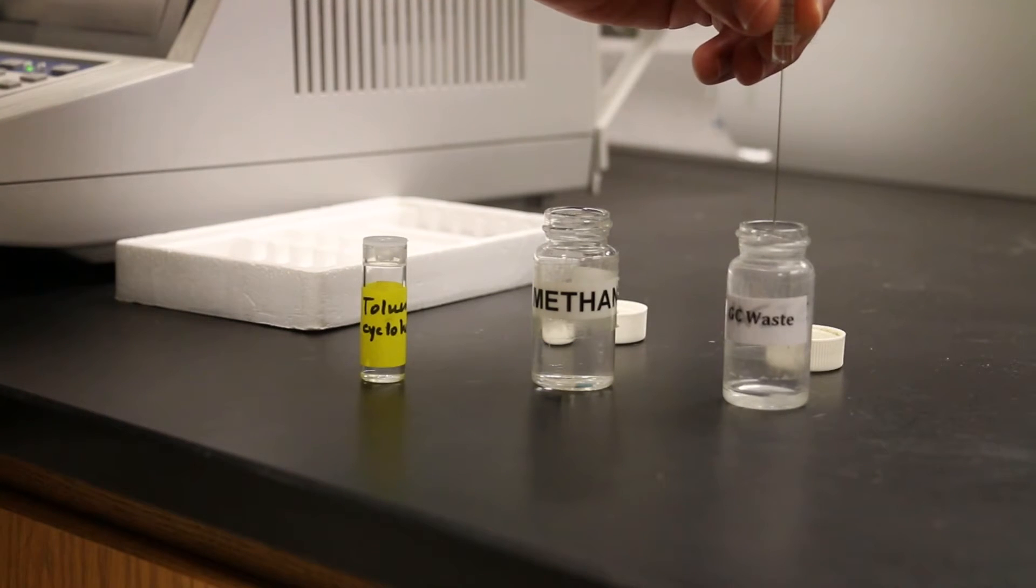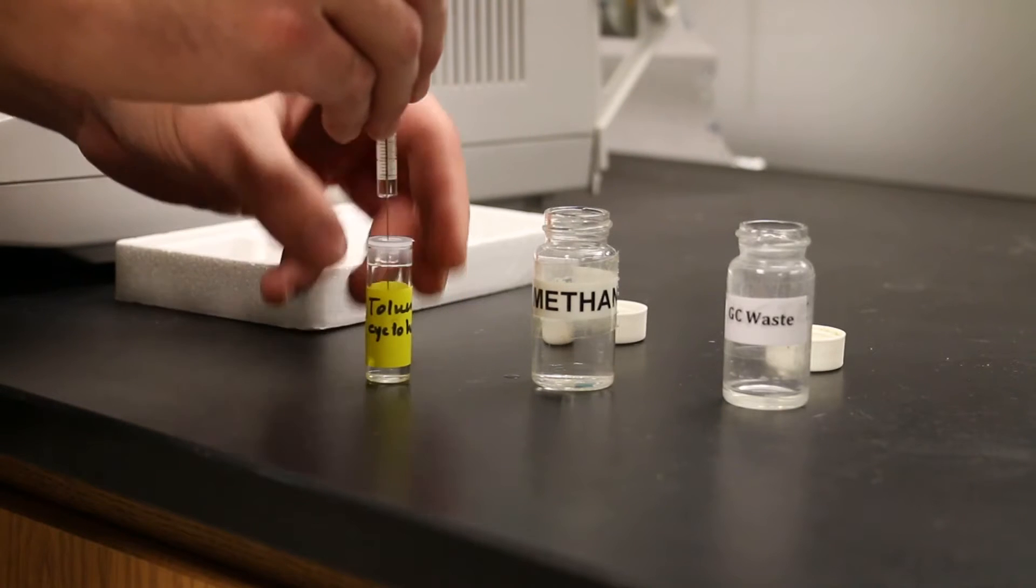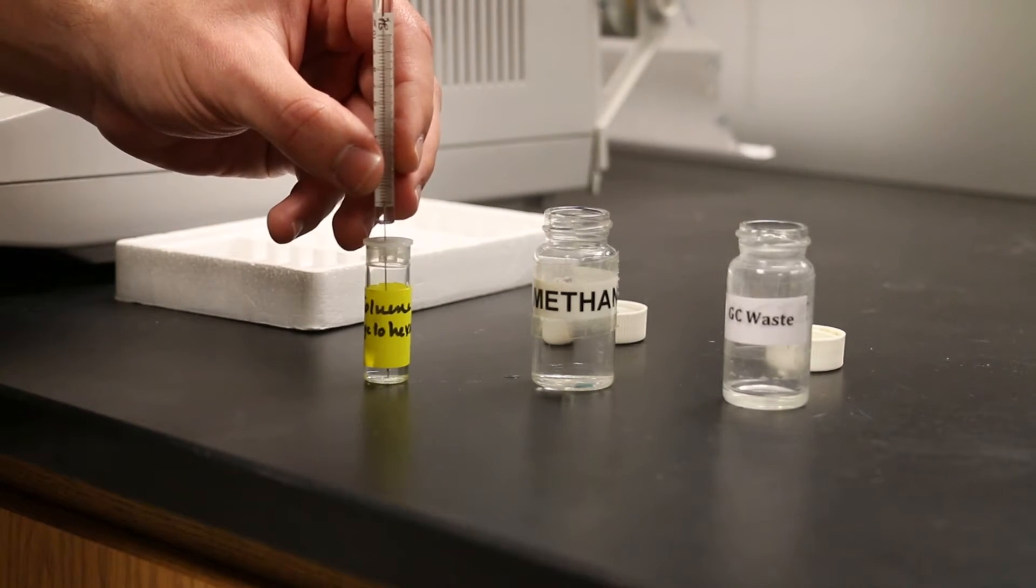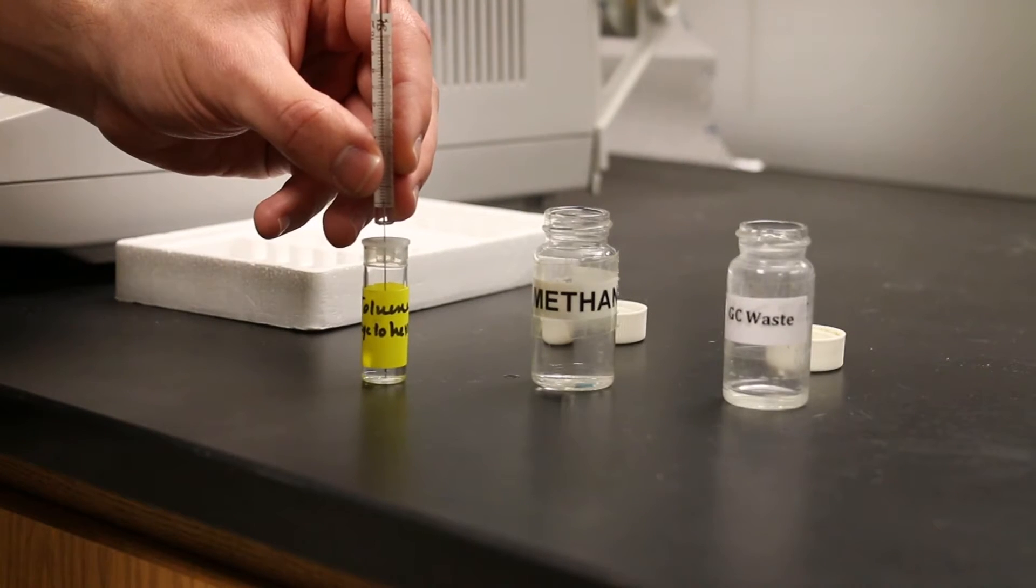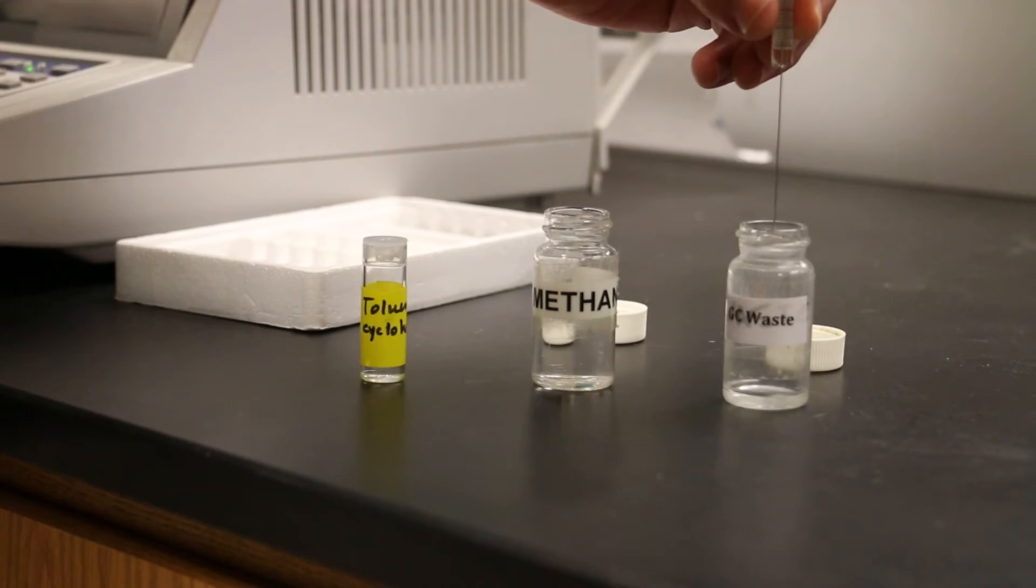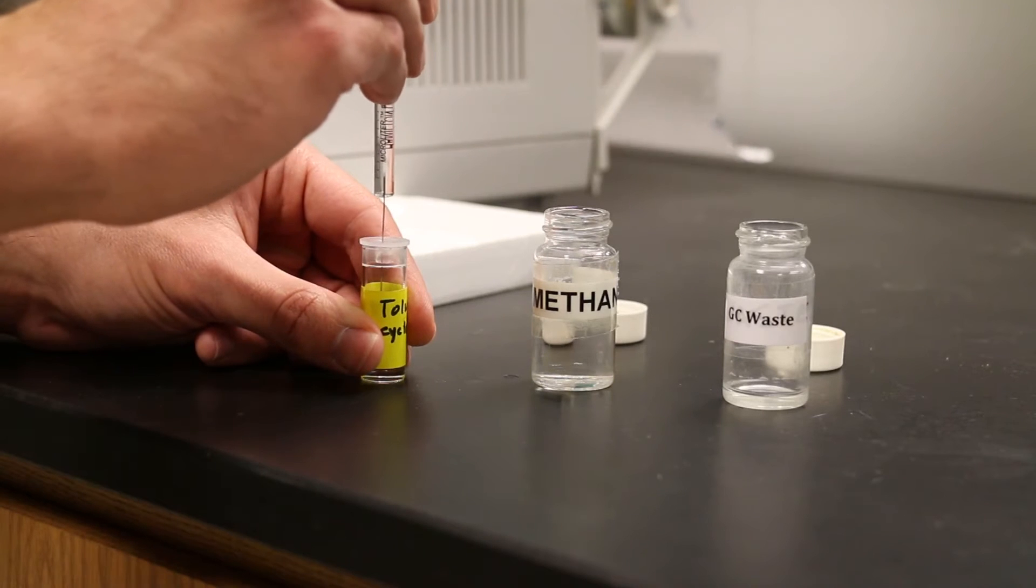After rinsing your syringe twice with methanol, you want to move the syringe to your sample and rinse the syringe twice using your sample. Your sample will probably be in a vial with a perforated cap that the syringe needle can push right through. Repeat the rinsing of your syringe with your sample. Now you're ready to put the sample in the syringe for an injection.